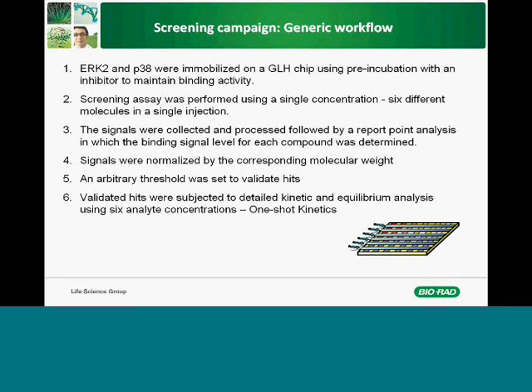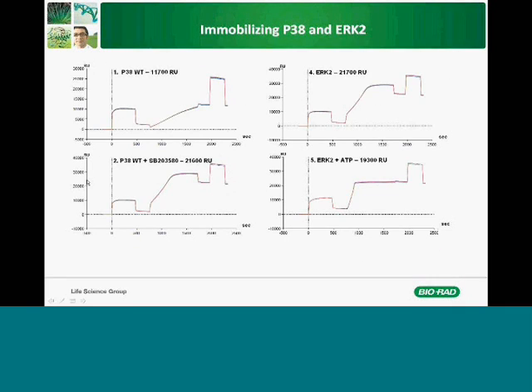And here you can see the immobilization scheme again of the P38 and the ERK2. So again, we immobilized the P38 once just unprotected, and in another channel protected with a known inhibitor, SB203580. You can see the immobilization level here. And also for the ERK2, immobilized unprotected, and immobilized when it was pre-incubated before the injection with ATP to protect the binding site.